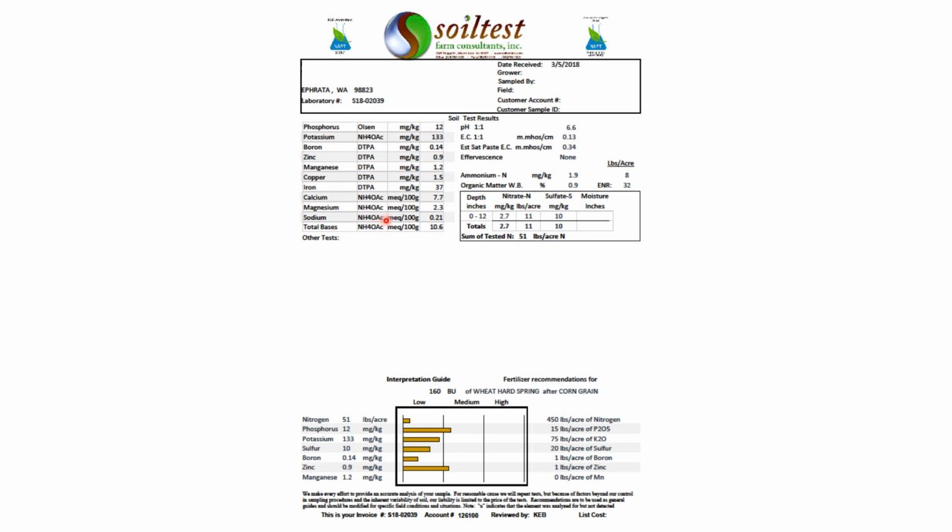You'll notice that the units here listed are not parts per million. In this case, they are milliequivalents per 100 grams. We do this for convenience when we extract or determine the cation exchange capacity of the soil. Cation exchange capacity is listed in units of milliequivalents per 100 grams. So, in order to determine the percentage that these cations occupy of the cation exchange capacity, we list them in the same units for convenience.